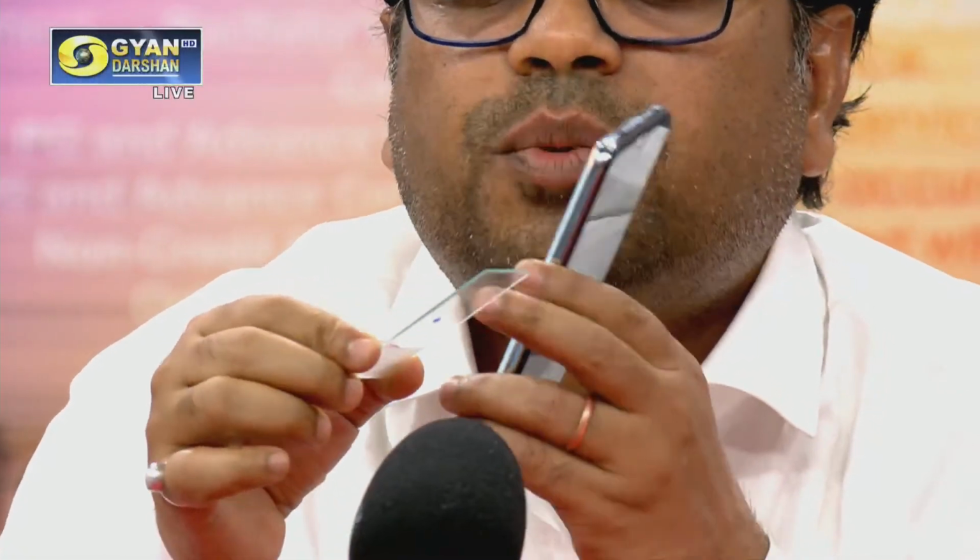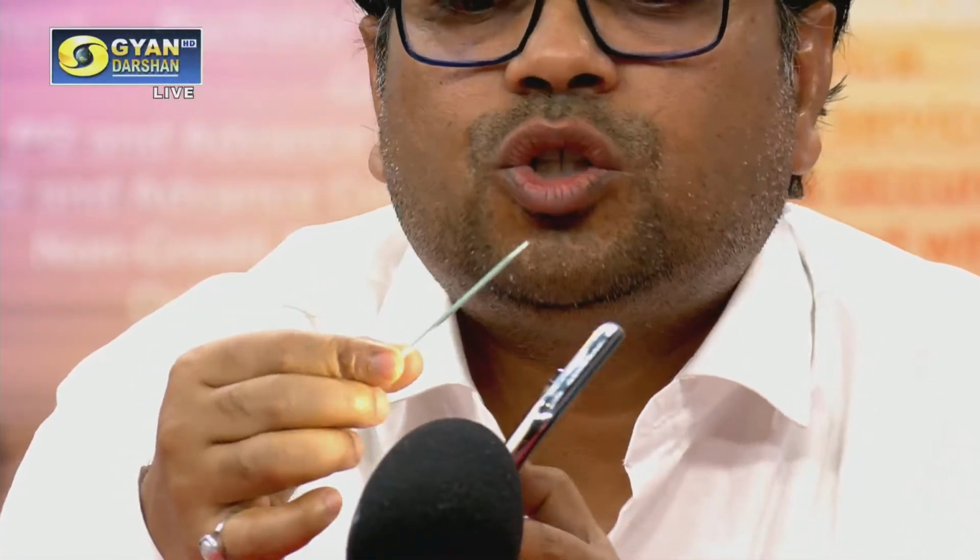Some light ultimately crosses the slide, and some of the light rays interact with the matter. So this blue ink spot can absorb some of the light and refract some of the light.